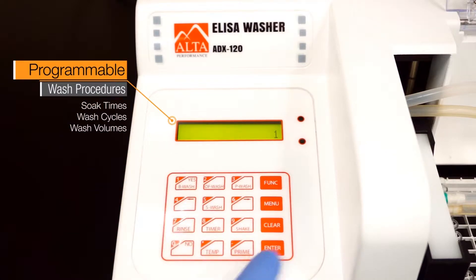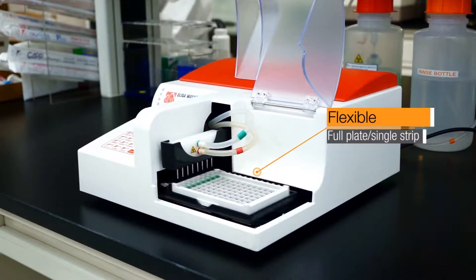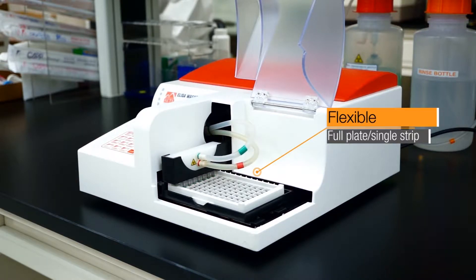These protocols can also be saved for quick recall. The Alta Microplate Washer offers flexibility and can capably wash a full plate or a single strip of eight wells.